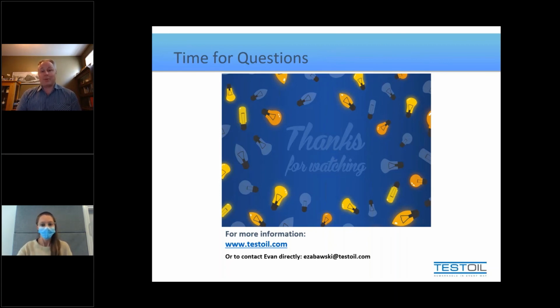Well, that sounds like the perfect question to give us a lead or segue into part 2 of this series, where we will talk about storage and best practices. But as to testing, really all you can do is either have your own particle counter, which they do sell portable versions of this, which use the same technology we do in the lab, or you can send a sample to the lab.